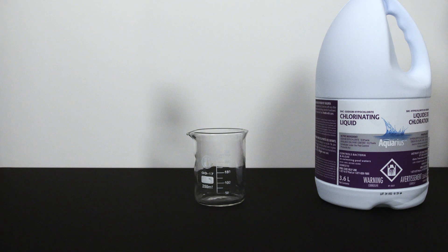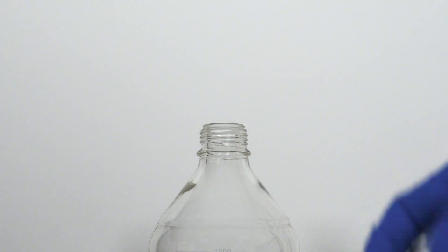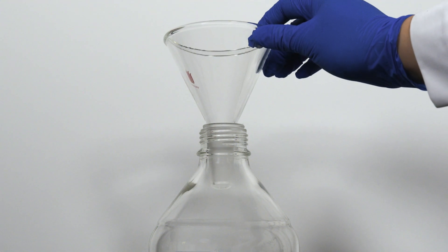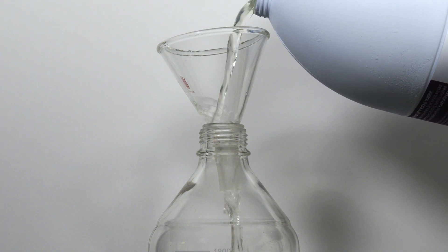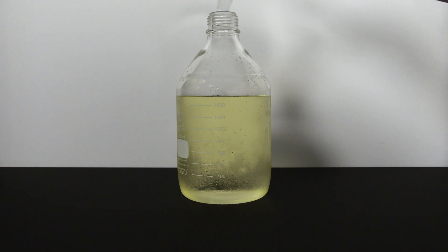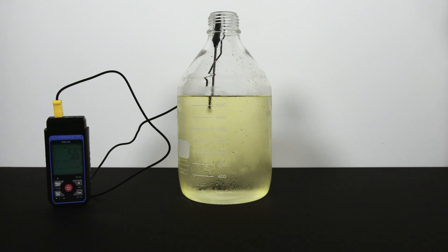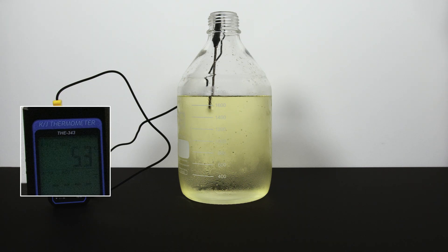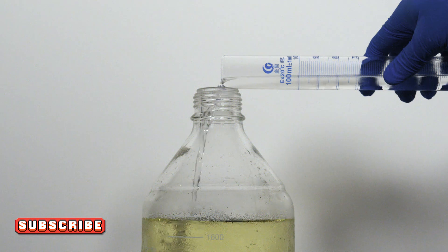However, I want to be completely transparent with you guys, so I will be using a transparent container. I am adding 1.8 L of 10.8% pre-chilled bleach solution to the container — it has to be chilled to 0°C or below. I was too impatient cutting corners here, and the final temperature of the bleach solution is just around 5°C. After that, add 50 ml of acetone to the bottle.